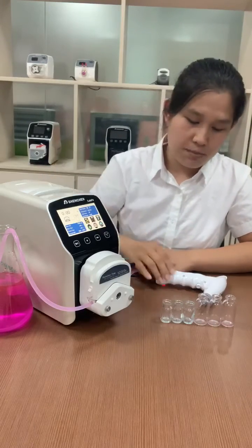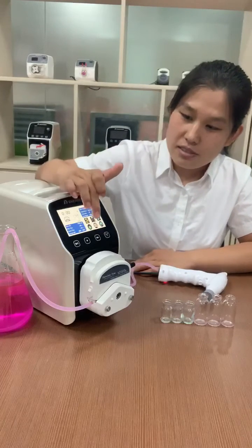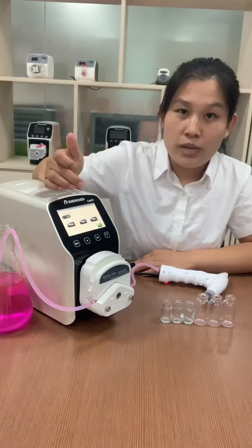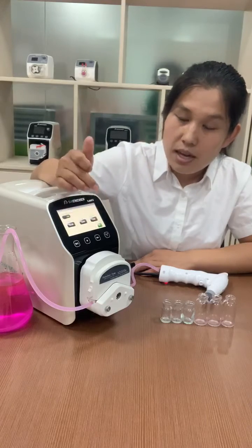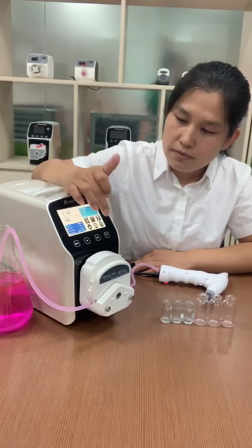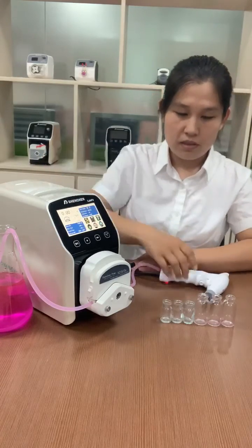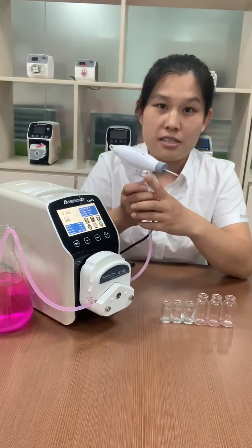We can start the pump manually or by this hand dispenser. First, let us set the parameters: filling volume 10 milliliters, runtime two seconds, pause time one second, and repeat numbers one. This is the hand dispenser, and here is the start button.